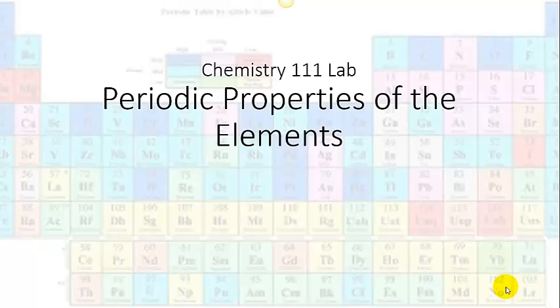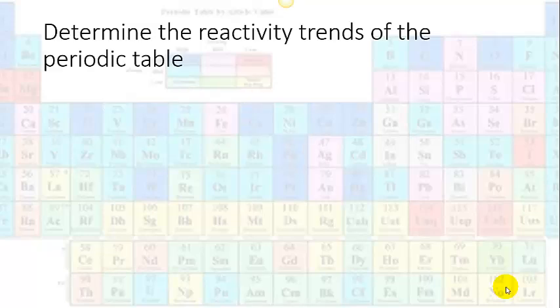This is your pre-lab video for Chem111's periodic properties of the elements. You'll be happy to know that this is a pretty short video as we do not have any calculations to do, so that should be helpful for you this week. Determining the reactivity trends of the periodic table, that's what we're doing in lab this week.